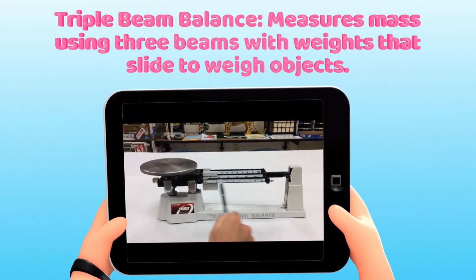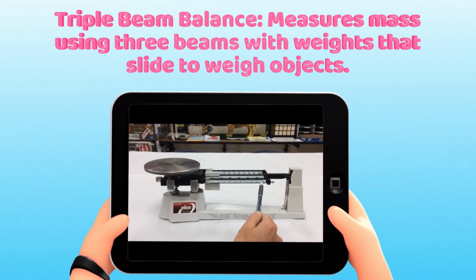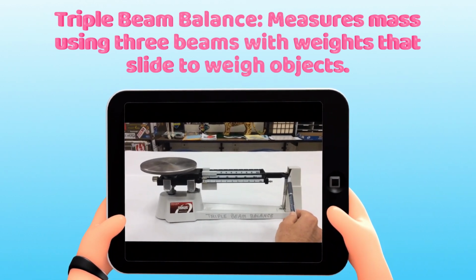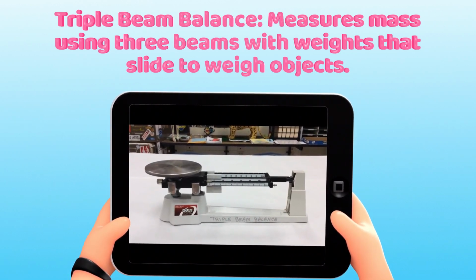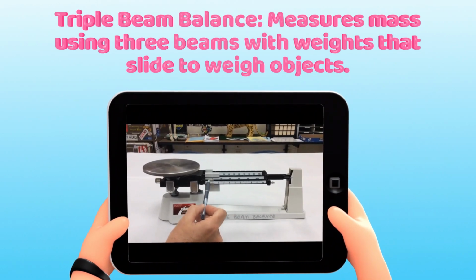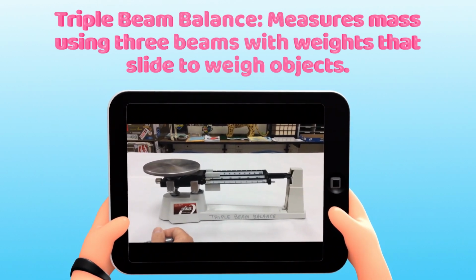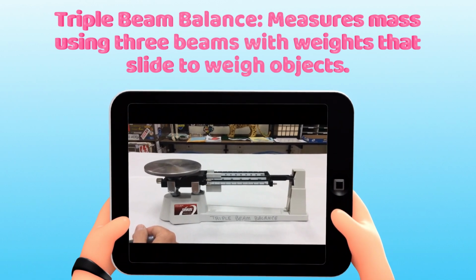Okay, another tool is a triple beam balance. This measures mass using 3 beams with weights that slide to weigh the object. As you can see from the screen, we have the middle part. That middle part can be slid to get the readings. And those are the 3 beams we are talking about.